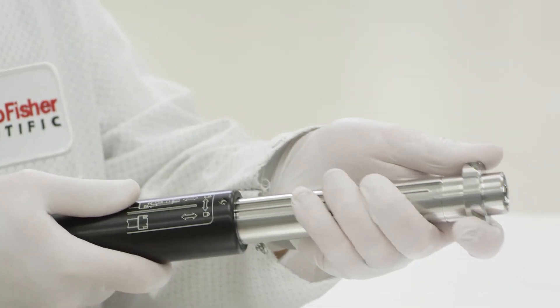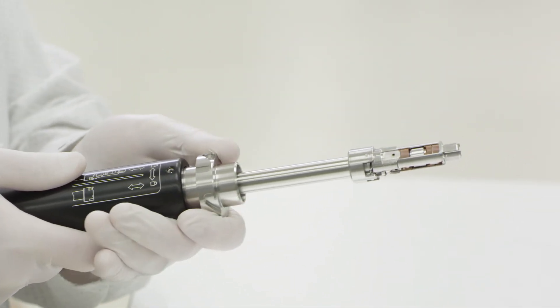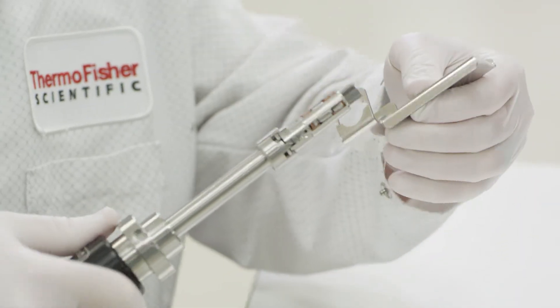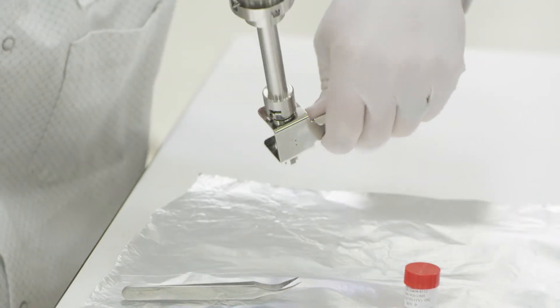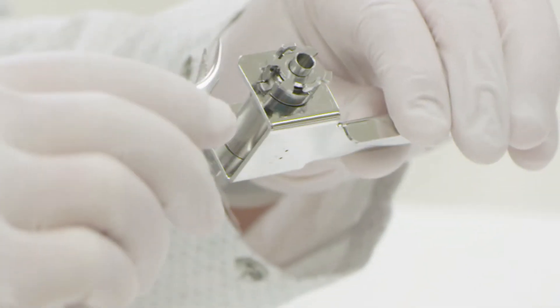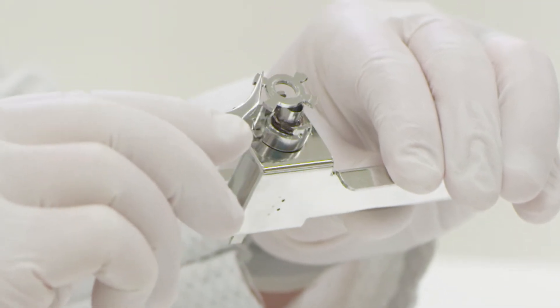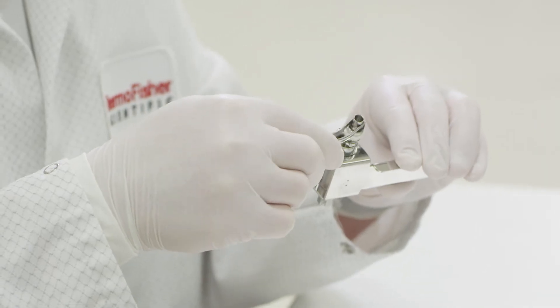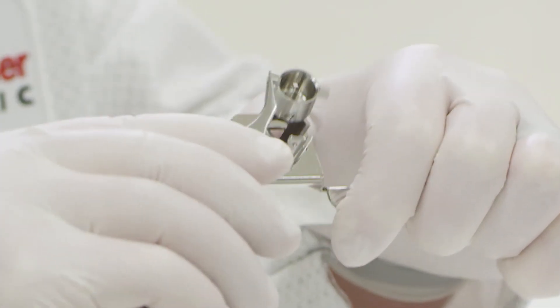The EI source cartridge is now on the installation tool. Caution: the source will still be very hot. Carefully place the EI source cartridge onto the source holder. When the temperature has lowered enough to be handled safely, remove the ion volume locking ring, repeller assembly, and EI ion volume.